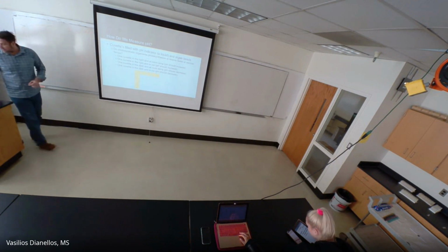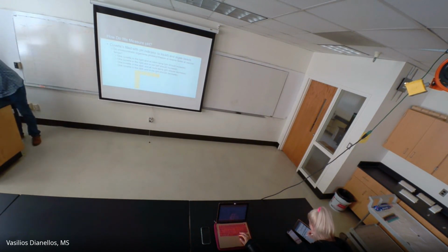So right here, where are we at? Room temperature should increase, yeah. So these 2, when we're looking for an increase, that's photosynthesis, right? We're looking for an increase in photosynthesis. These 2 are for respiration. We're looking for a decrease. Again, for the photosynthesis, both of them are in the light. For the respiration, both of them are in the dark. For the photosynthesis, one of them is at room temp, and the other one's at ice. For respiration, one of them is at room temp, one of them is at ice.